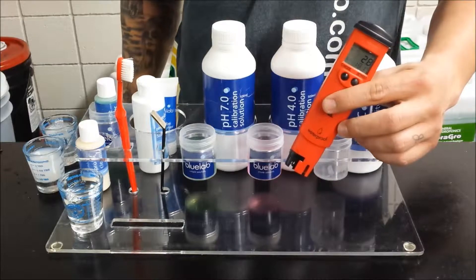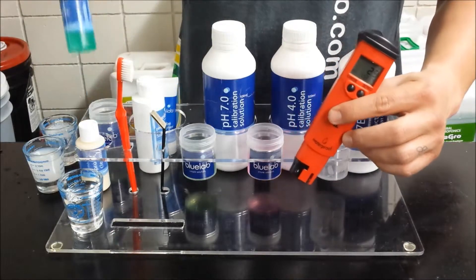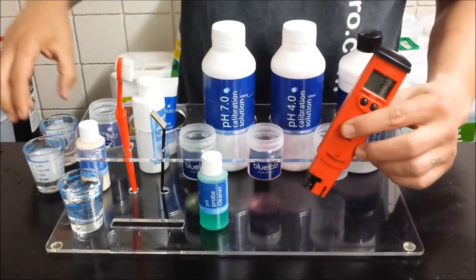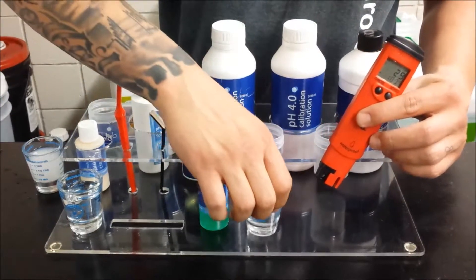First thing you want to do is make sure your pH probe is clean for calibration. So we have some pH probe cleaner here. Mix a few drops with water to get your cleaning solution.